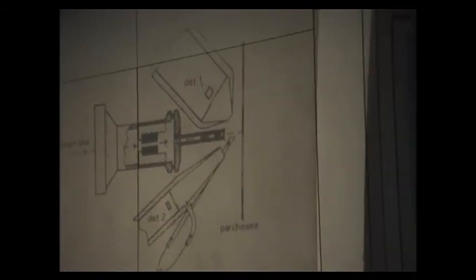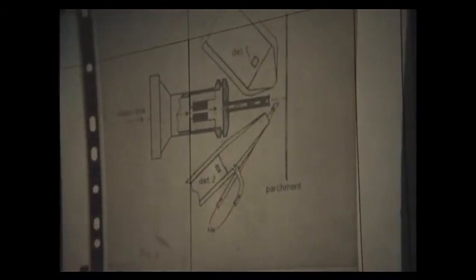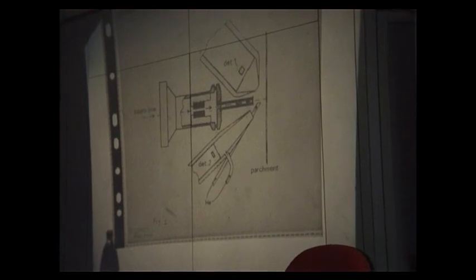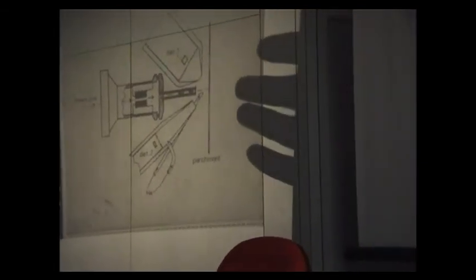Yeah, he was here, yes, we could talk about. Then he tried to recognize the ink used by Galileo in his scientific writing by comparison with his book notes, in which he noted when he was purchasing potatoes and so on, because probably he was using the same ink. Then it is the same technology used here in Florence.